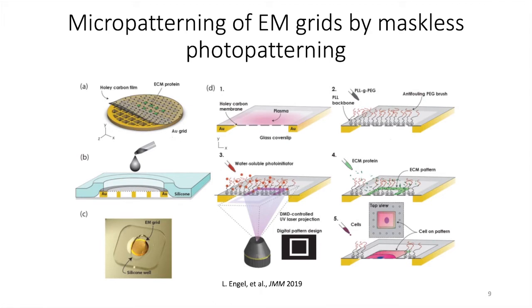Once the grid was immobilized, we subjected it to atmospheric plasma at 30 watts for 10 seconds to render the surface hydrophilic. And you can see that pink gas in D1. We added poly-L-lysine-grafted polyethylene glycol, PLL-g-PEG, at a concentration of 100 micrograms per milliliter to the surface and incubated for 1 hour to electrostatically adsorb the PLL-g-PEG to the surface. And this occurred via the positively charged PLL backbone. The densely packed PEG side chains provide the grid surface with anti-fouling properties against protein adsorption.